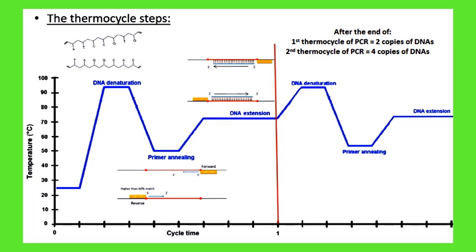The end of elongation is also the end of this first cycle, as you see in this figure, lined with the red color.